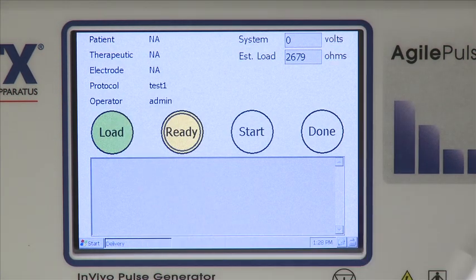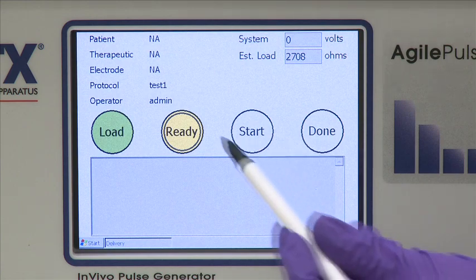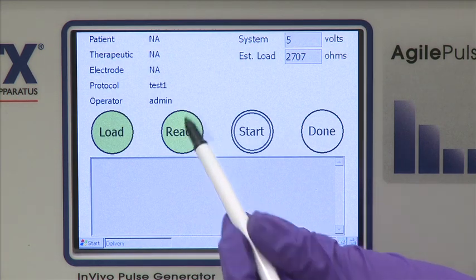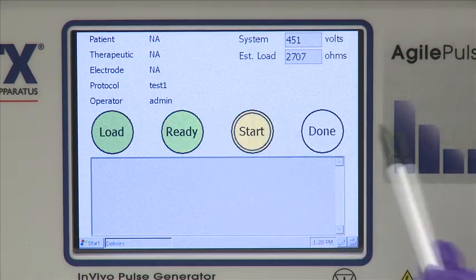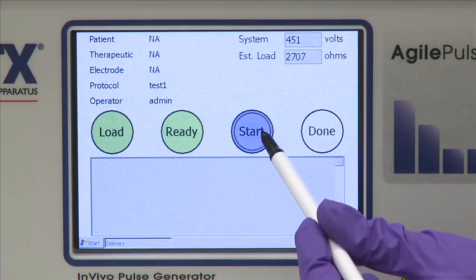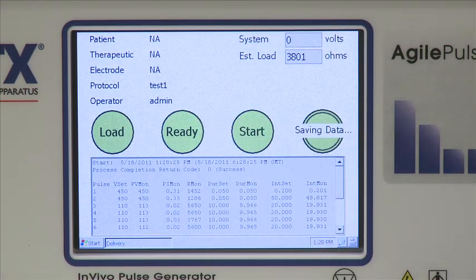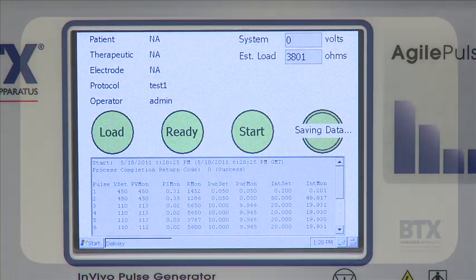Click on Load to make a load estimate, click Ready, then click Start. The parameters of the delivered protocol are displayed.